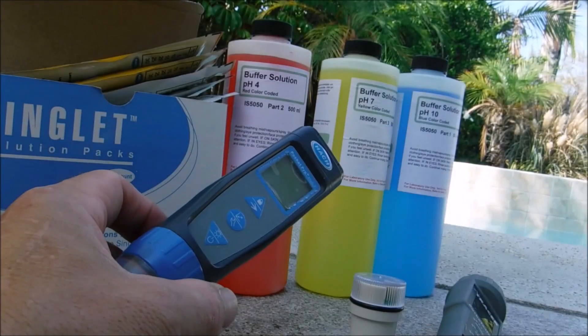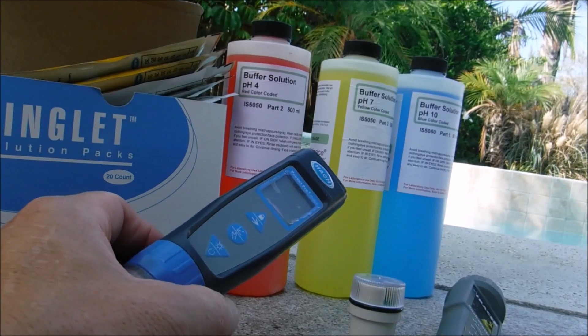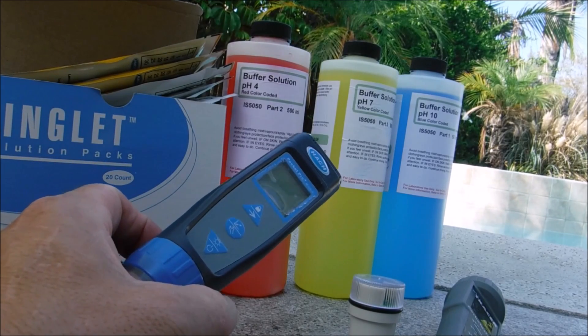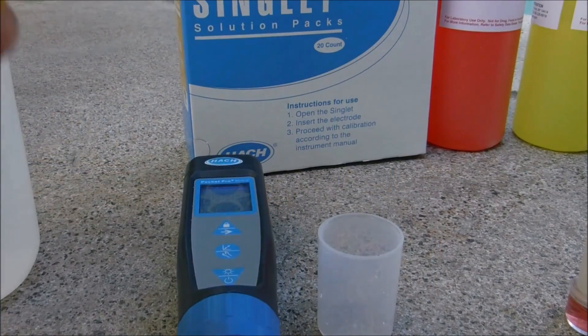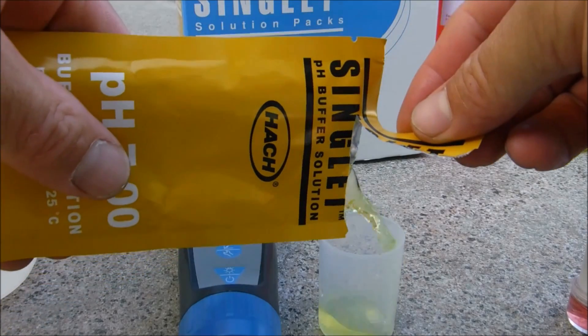When testing for pH, you want to make sure that the digital tester is calibrated. Once calibrated, if you have a good quality tester, the readings will be very accurate. Simply recalibrating your unit will give you good, accurate pH readings.